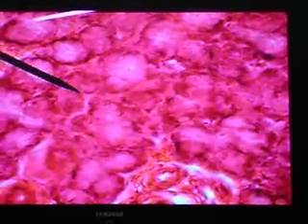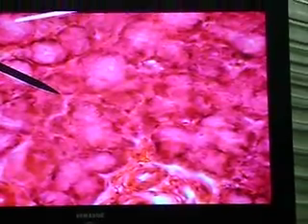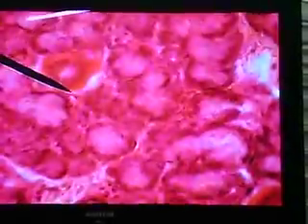Columnar. So to answer the question, once we encounter a duct within the lobule, and it's very obvious that there is columnar epithelium to it, then that is a striated duct. Alright? So these little tiny ones right here with cuboidal epithelium, that is, now that screen is showing it better up there.